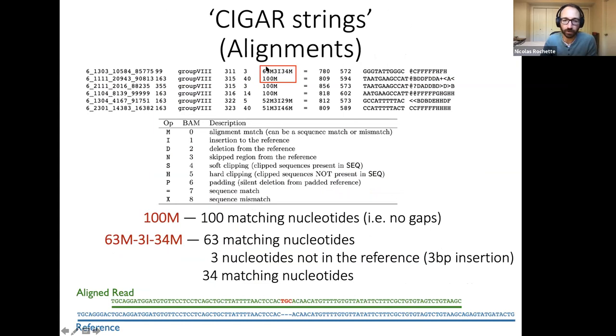And so these are just two examples of CIGAR strings, like 100 matches. And again, this table here is from the description of the SAM format. The M letter stands for match, meaning the read and the sequence are just face to face without any offsets. And then we have these other CIGAR operations, which can be essentially indels, so either insertions or deletions. These would be the main ones for RNA reads especially. We're going to see these Ns as well, which are introns.